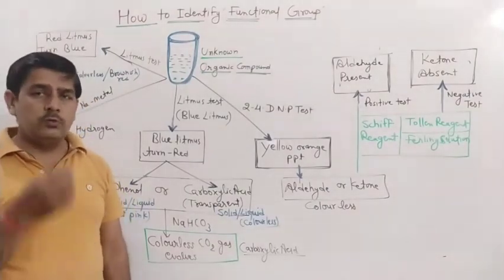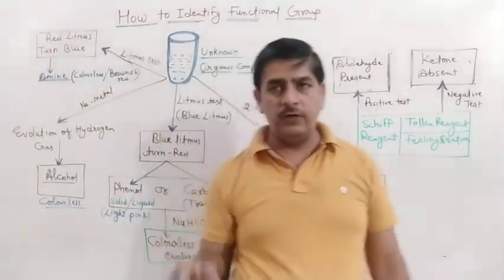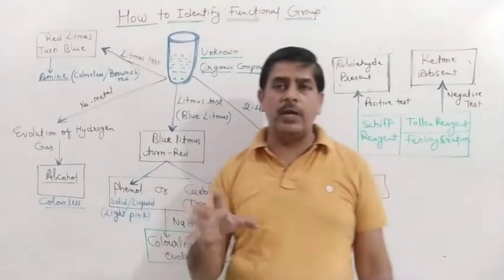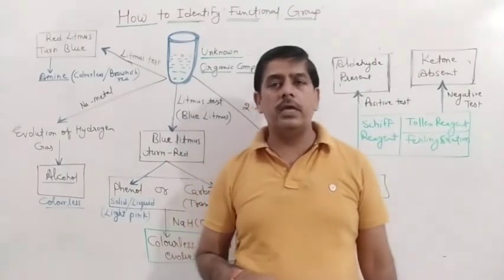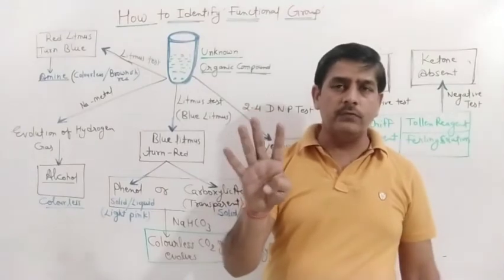Okay, and one more thing, you can smell it also. Alcohol and spirit smell are the same. If it is giving a smell of spirit, obviously it is alcohol. Okay, this is the fourth one. I think you can easily identify the fourth functional group.